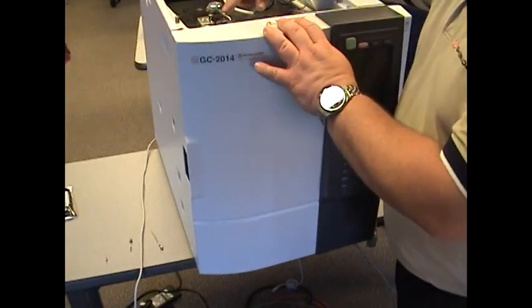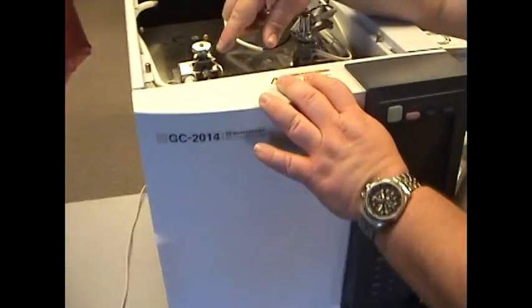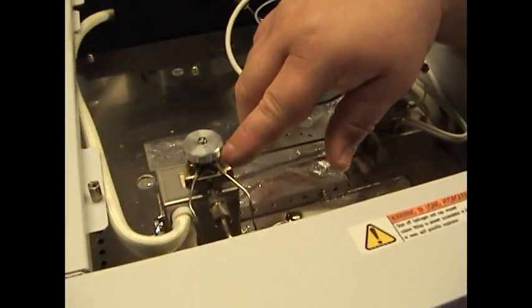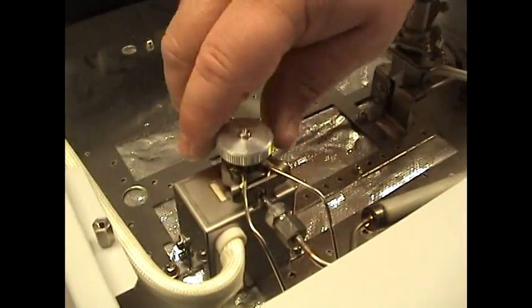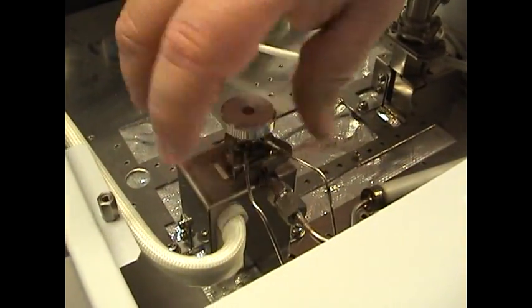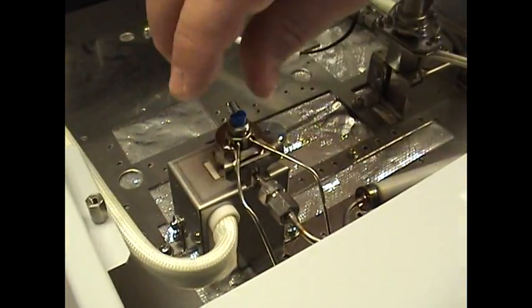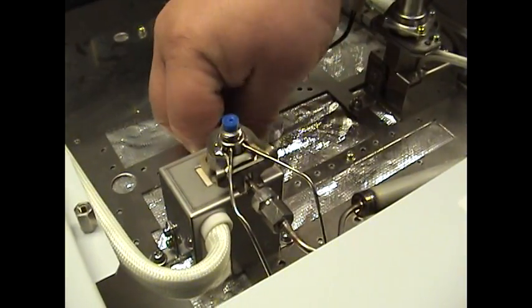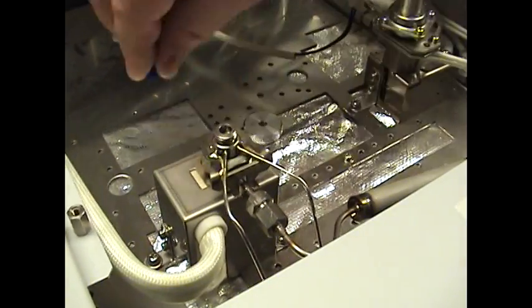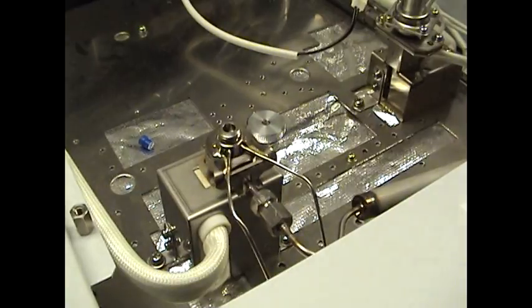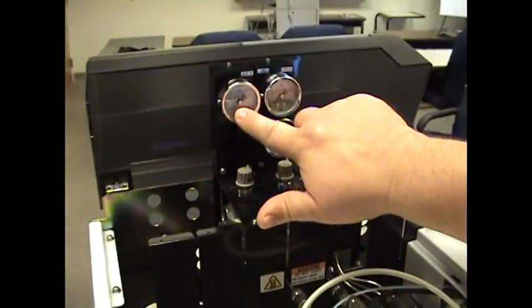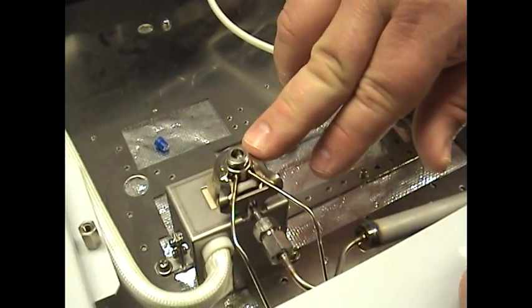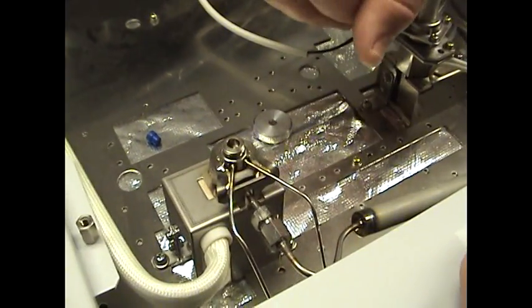Alright, in this segment, we'll discuss how to change the glass liner or the glass insert in the GC2014. In the previous segment, we discussed how to change the SEPTA, so we're not going to go through those steps again. However, the same precautionary steps must be taken. Makeup air needs to be zero. The injection port must be cooled and the instrument should be turned off.